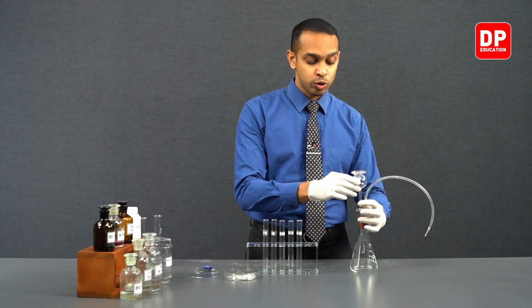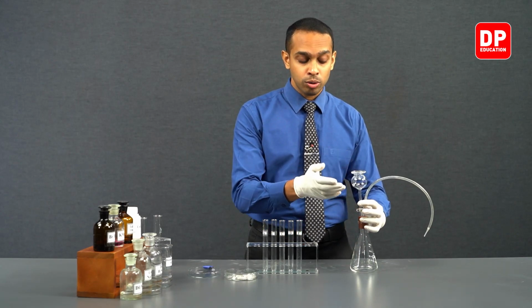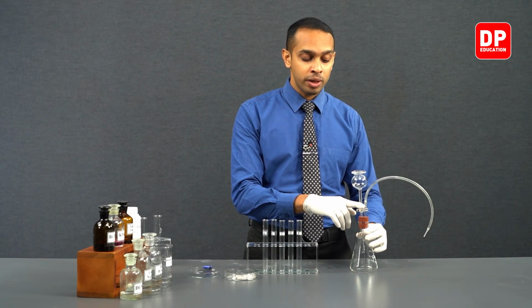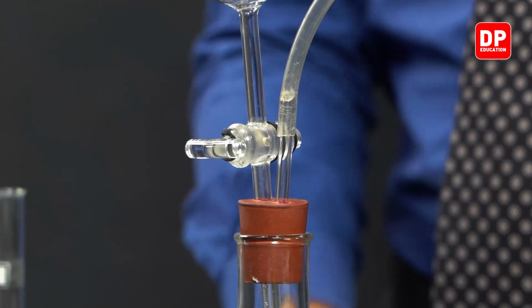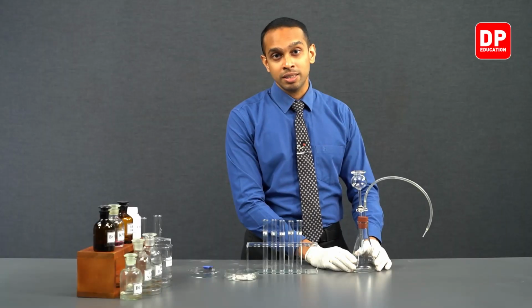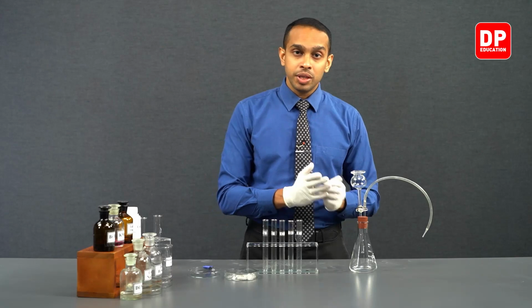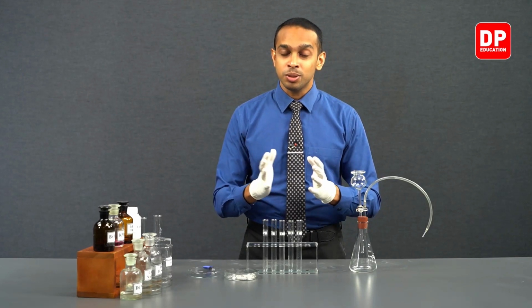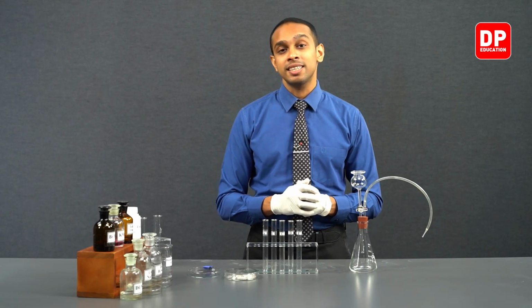So the gas cannot climb through the thistle funnel and come out over here, and there is also a valve here that we can open and close to regulate the amount of water that we add to our calcium carbide. So this is the setup that we will be using to produce ethyne gas or acetylene gas.